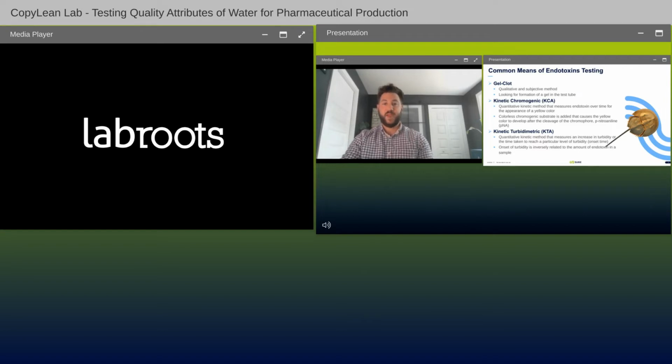This is another quantitative kinetic method that measures an increase in turbidity or the time taken to reach a particular level of turbidity, also known as onset time. The onset time of turbidity is inversely related to the amount of endotoxin in a sample.